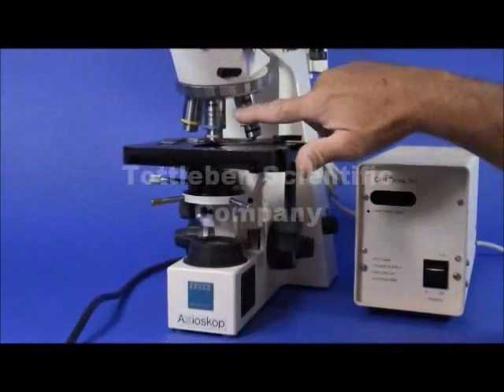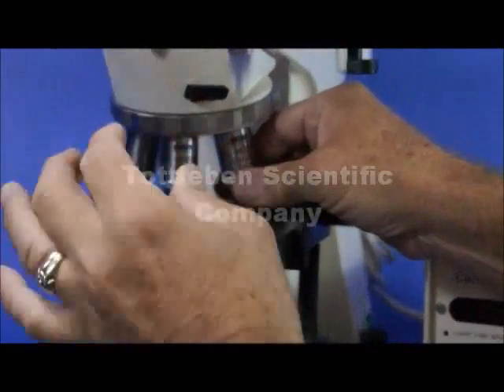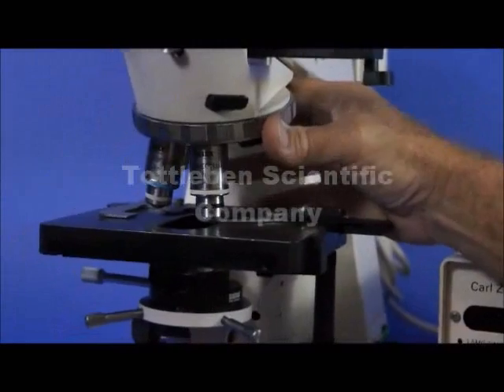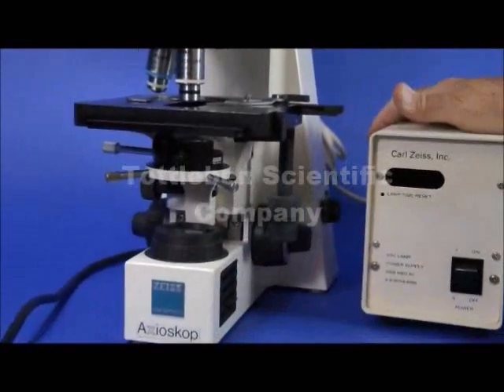Next to the 40X Neofluar is a Plan-Neofluar 100X, and it has a numerical aperture of 1.30 for oil. It's a very high resolution, very high numerical aperture oil objective lens.